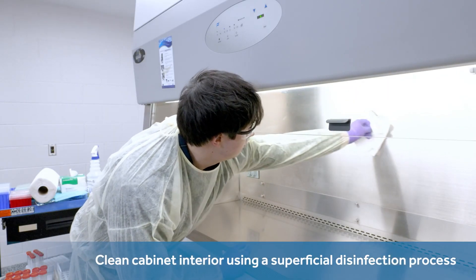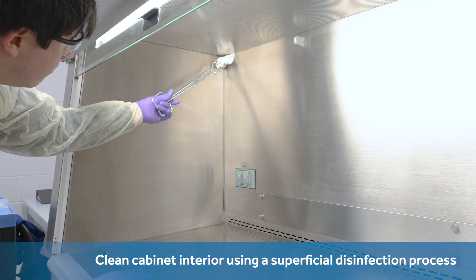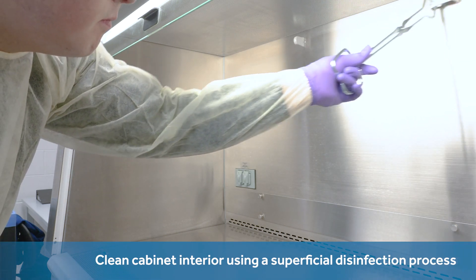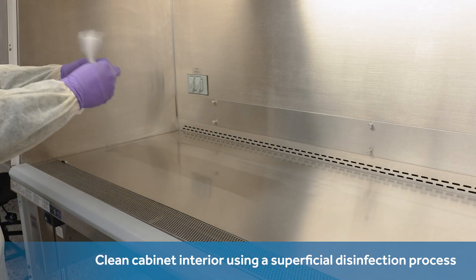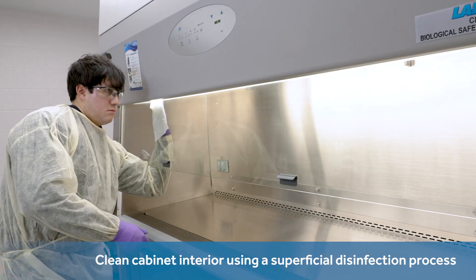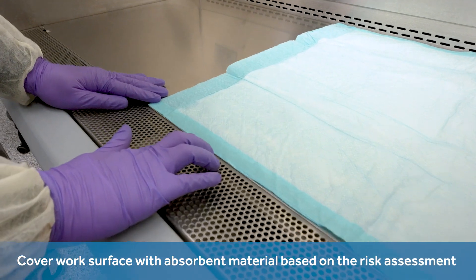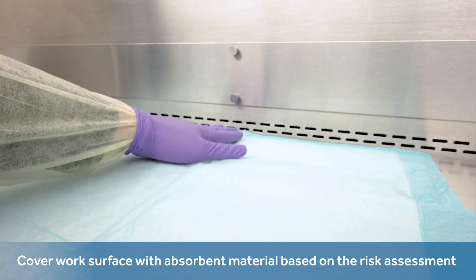At this point, biosafety guidelines and experts typically recommend putting the inside of the BSC through some type of superficial disinfection process. Industry guidelines and experts note that any chlorides must be rinsed off the places where they were applied as a disinfection agent in order to stop them from rusting, often referencing the use of clean water or alcohol for this purpose. Some guidelines refer to the practice of covering the work surface with an absorbent material whose underside is made of plastic; however, they remind one to keep the air vents from being blocked by it.